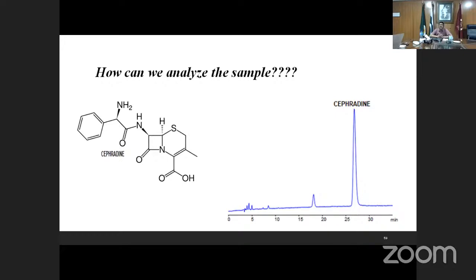You can see when an air bubble is in the detector, a very sharp and very thin peak will appear, and continuously the difference is that the air bubble peak is not reproduced at the same place. Retention time is not fixed, so it varies. So in this way, we can observe that something has happened in it.